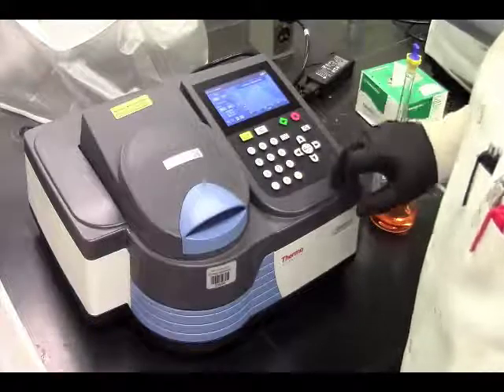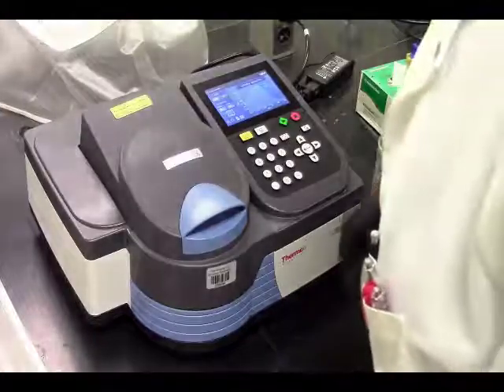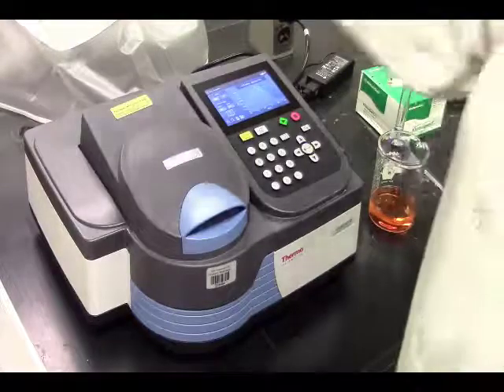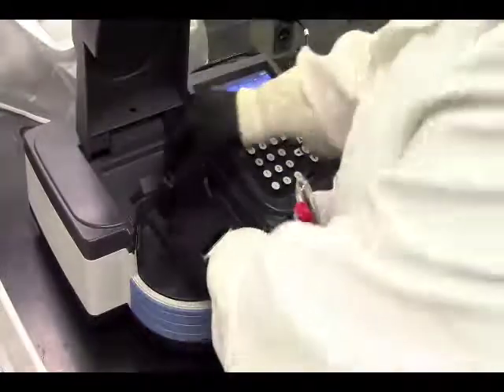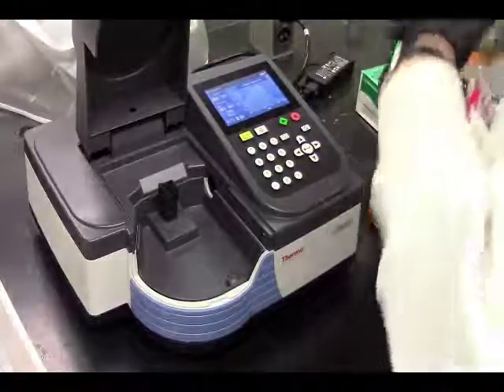We have a lambda max of 510 nanometers. This has an absorbance of 0.104. Could you write this down? Yeah. 0.104. That's fine. This is for the second sample in the standard. We'll empty that. Absorbance for what? 0.104.